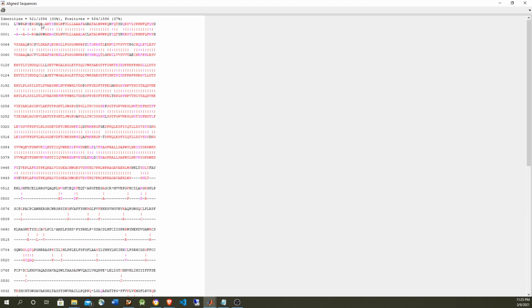You can see that it's comparing. The vertical bars are where there's a match, others are mismatches, and we can see that there are a lot of matches at the beginning. And notice that we get dashes to basically stretch one sequence and stretch the other. The top one, I understand, is the human one, and the other one is the mouse.